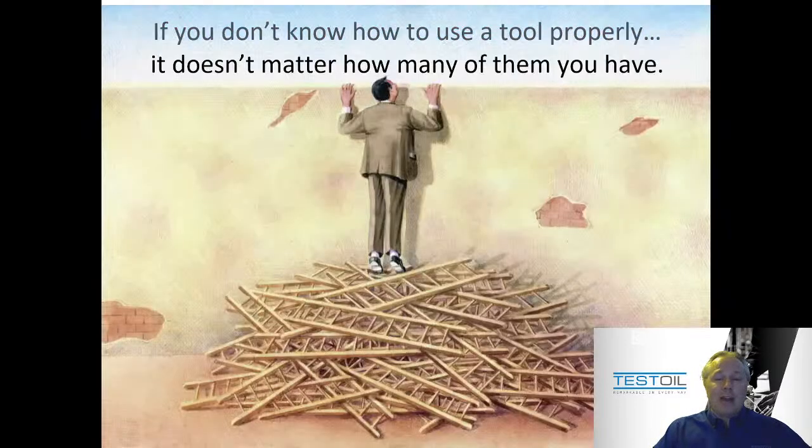So we're not using the tools the way they're meant to be used. And the last commentary here, and why we're going to go through how to read a report, is that you've probably heard this expression, maybe paraphrased a little bit differently. But if you don't know how to use a tool properly, it doesn't really matter how many of them you have, right? You need to know how to use these tools properly. In oil analysis, the report itself is a tool.